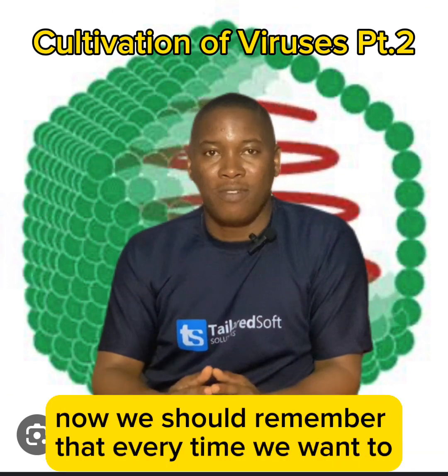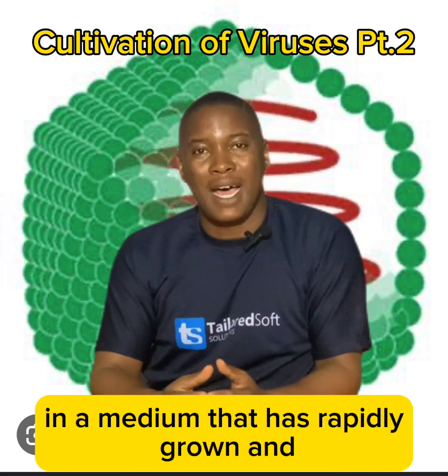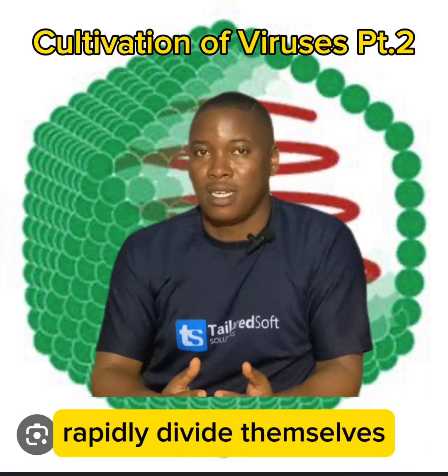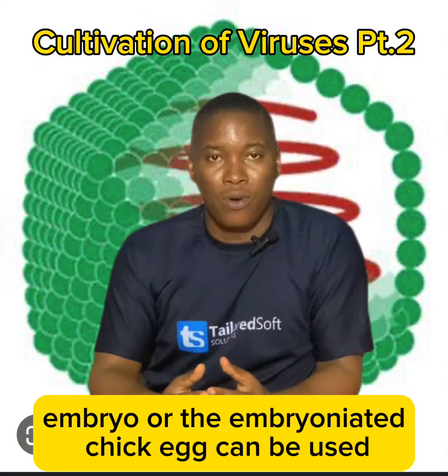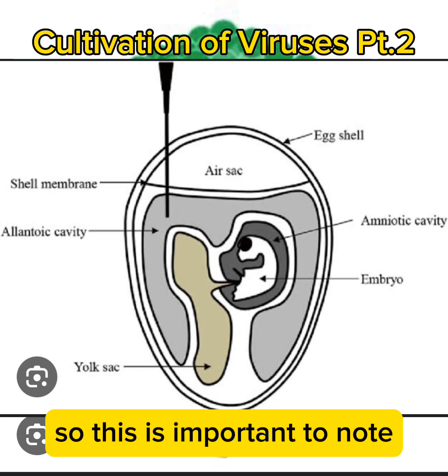Now, we should remember that viruses are usually cultivated in a medium that has rapidly growing and rapidly dividing cells. That is why the chick embryo or the embryonated chick egg can be used. So this is important to note.